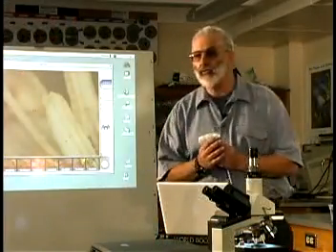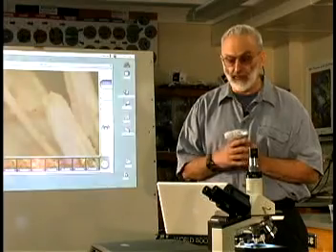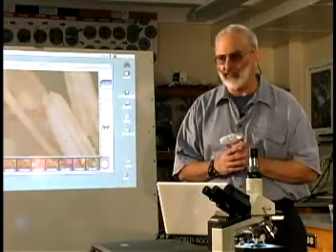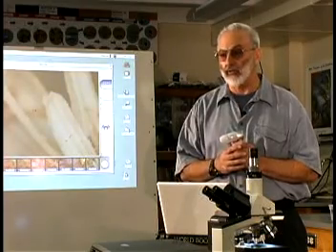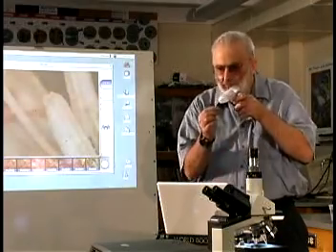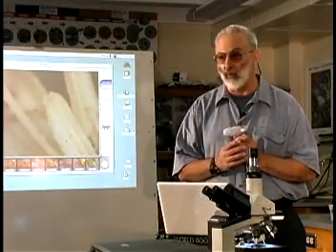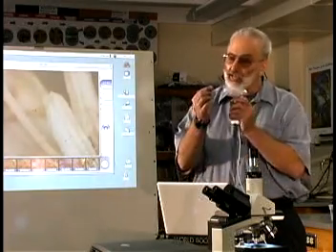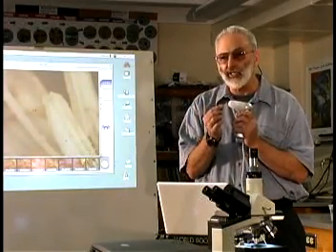The best way for you to capture images in this lab is to use our microscope in the handheld fashion as opposed to putting it on a tripod. This will allow you more freedom of movement, and you'll be able to manipulate it a little bit better with the flower. The images that I want you to capture: first, a side image so that you can see the petals and sepals. Then the base of the stem where the stem meets the flower, which will show the sepals and what kind of arrangement they have there.